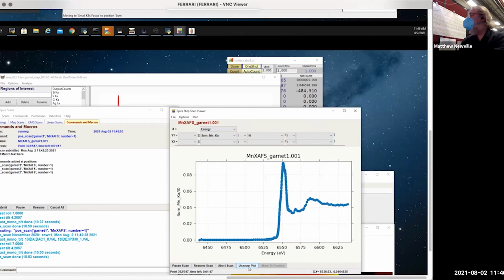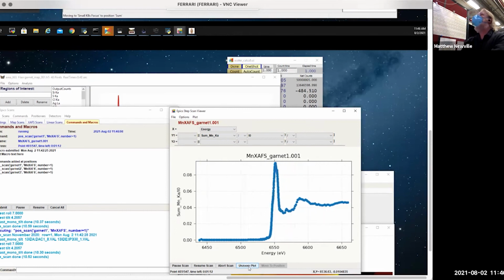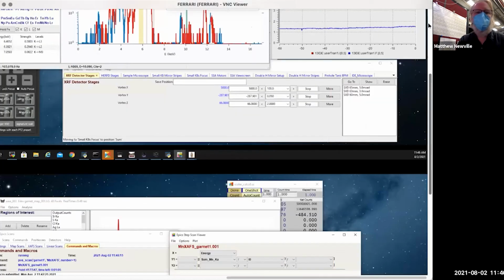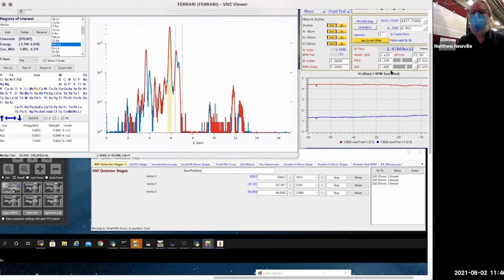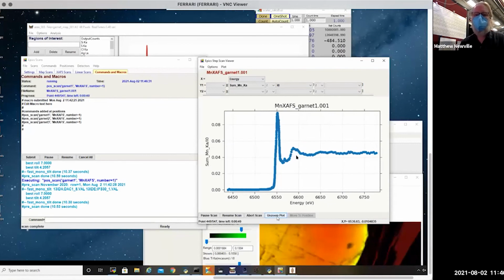It just shows some heterogeneity that's interesting. And so that's typical fluorescence XAFS. Again, we're going kind of fast on this, and the count rate, if I show this, this is a sum of the detectors. Each detector is displaying about 100,000 counts per second of manganese, at least on this spot, and we've got seven going simultaneously. So that's a noise level that's a little on the typical side, but you can also see it's pretty reduced.